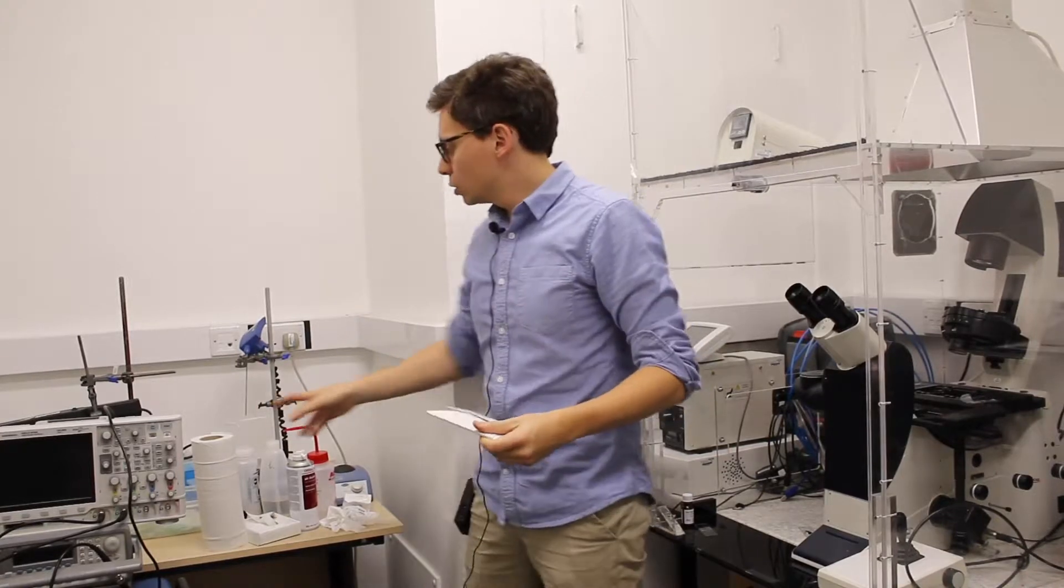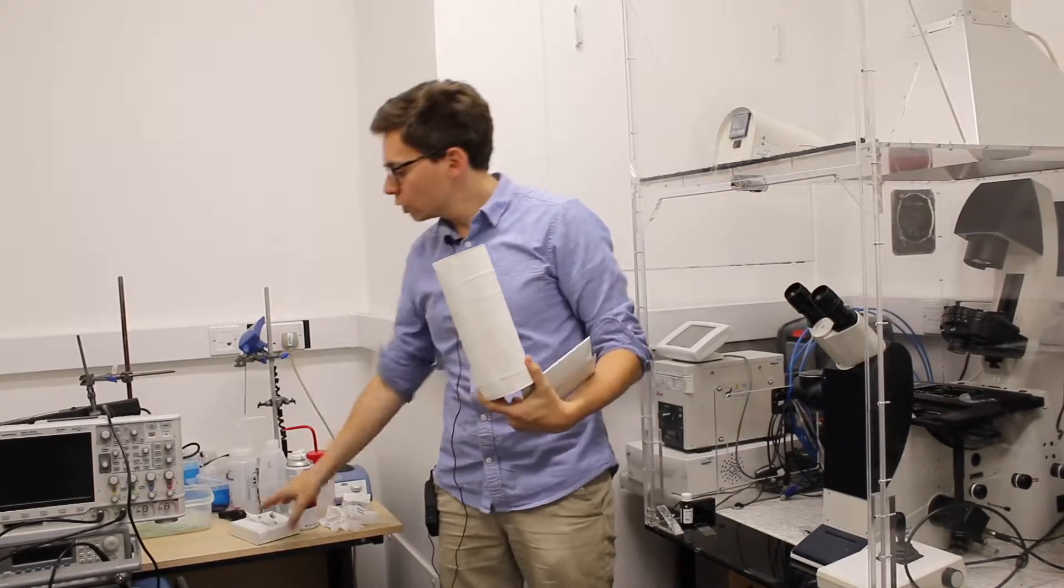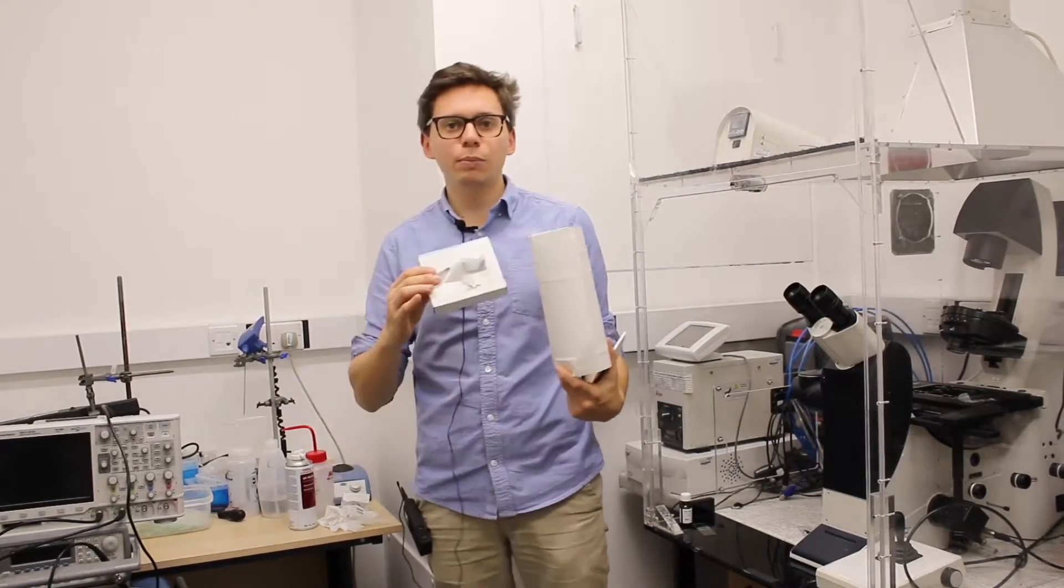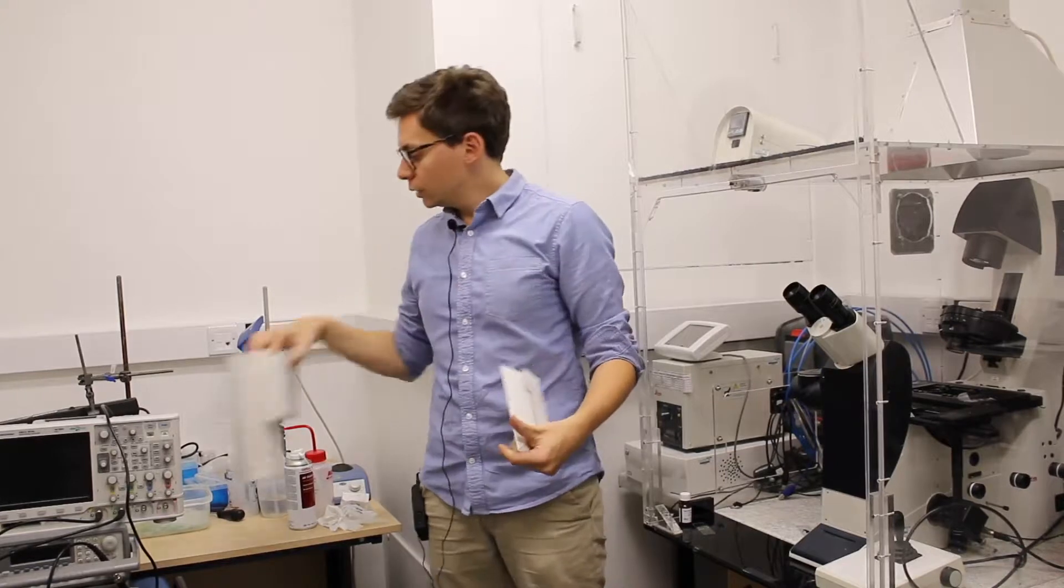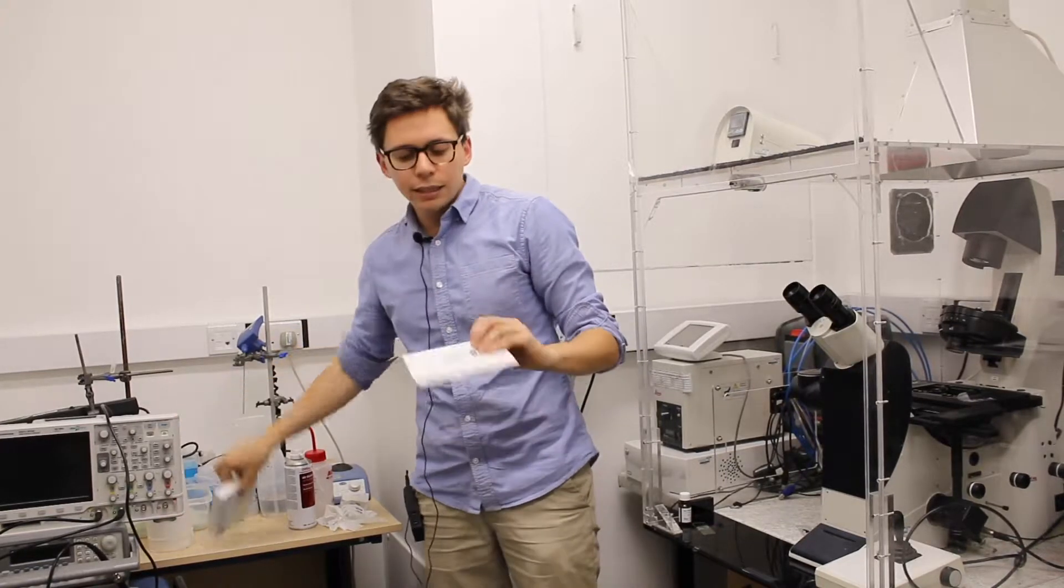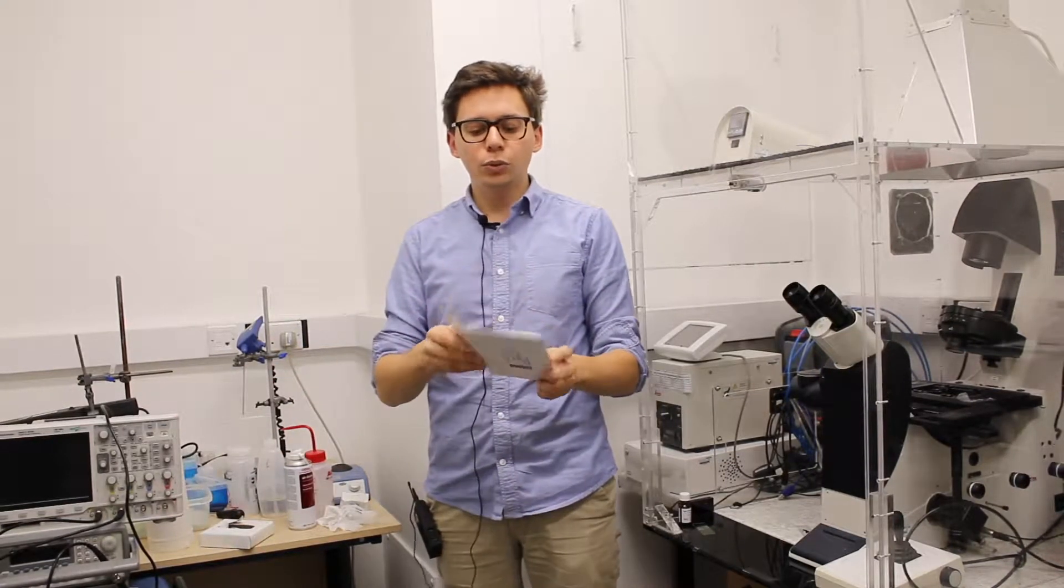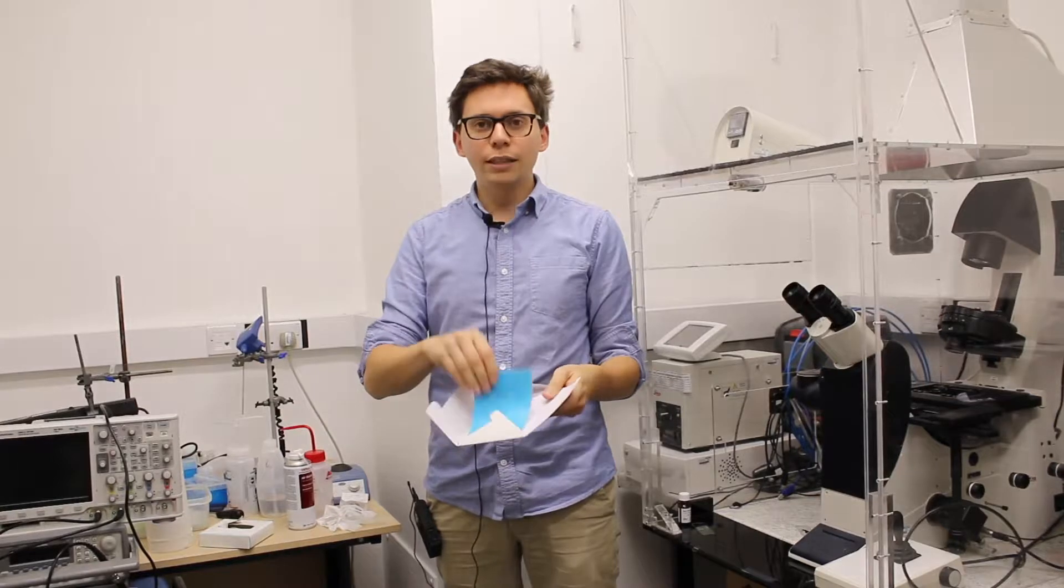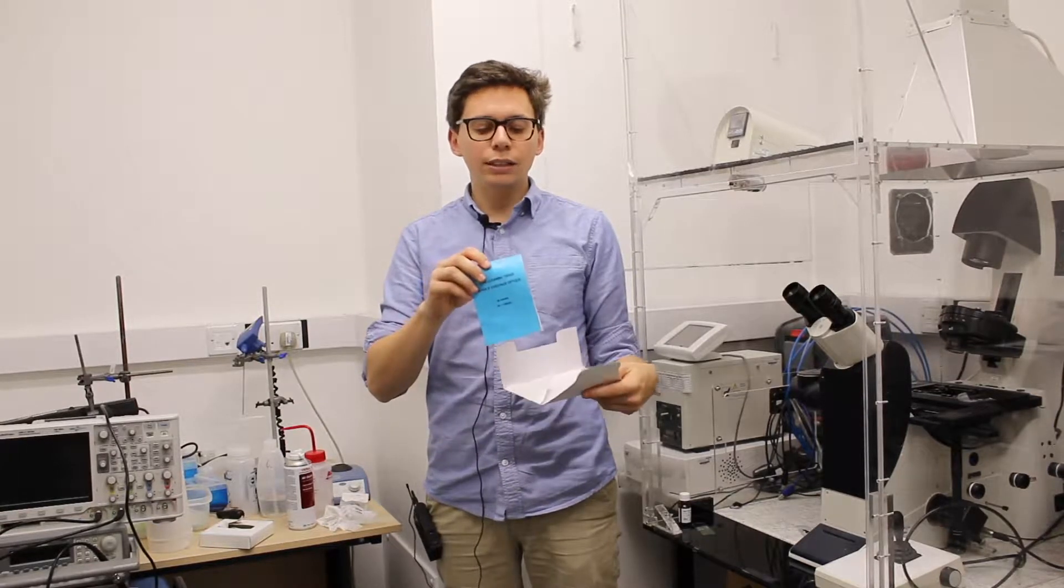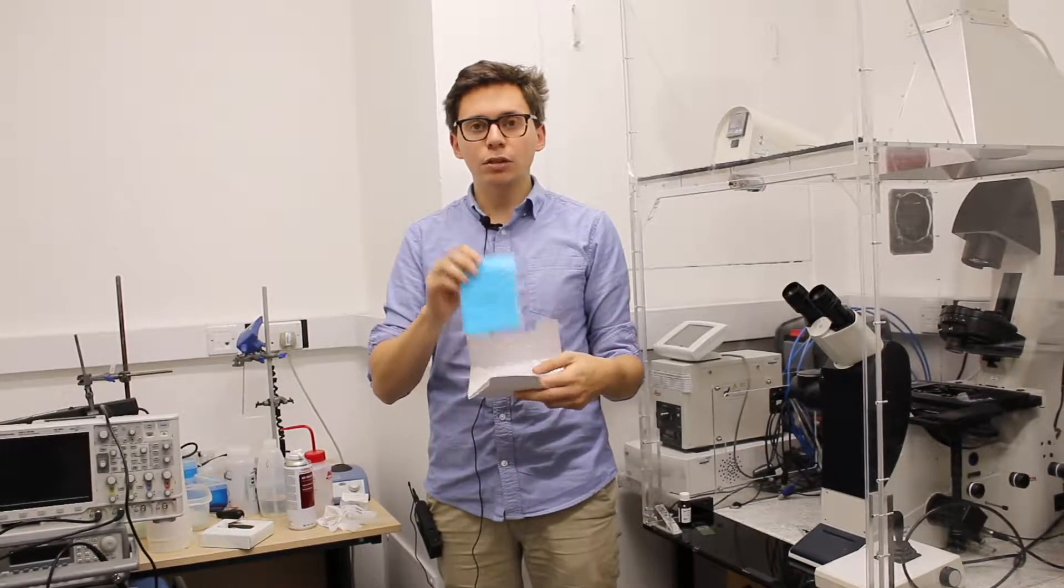you shouldn't use this type of paper or this type of paper to remove the oil, but rather you should use these lens cleaning tissues, which are more gentle and will not leave any scratch on the objective.